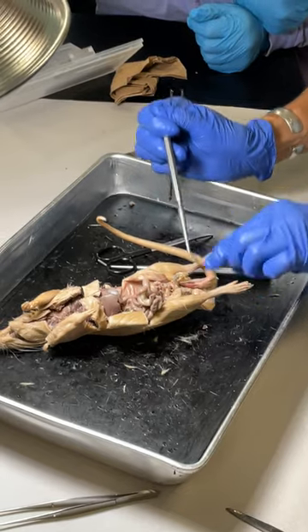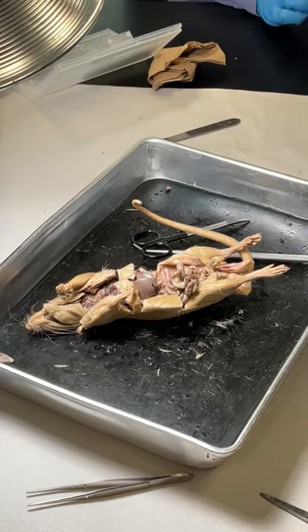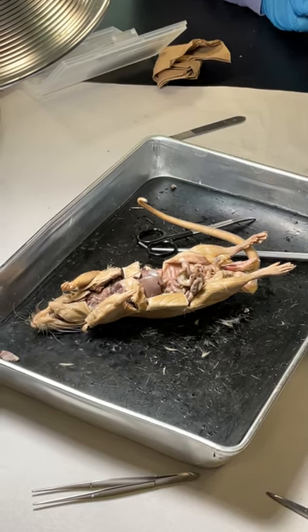Good? Okay, that's how sperm gets back in. Just like eggs have to come from the ovary through the fallopian tube to get back in. Good? Okay, let's go do the semen.